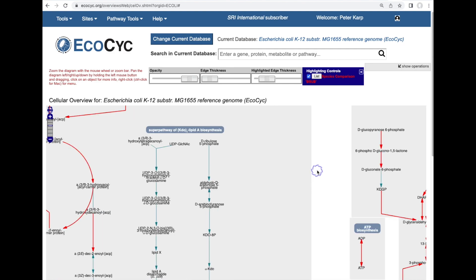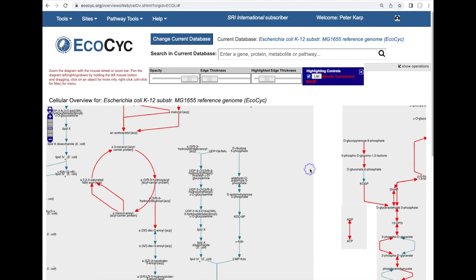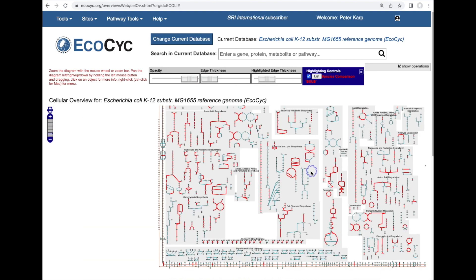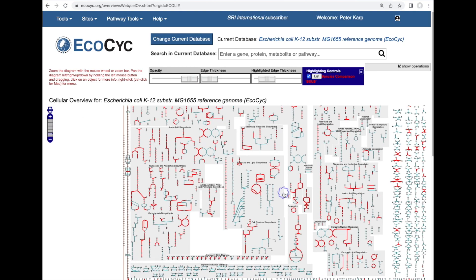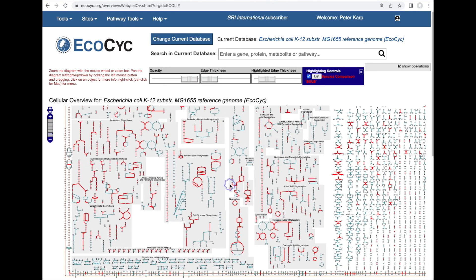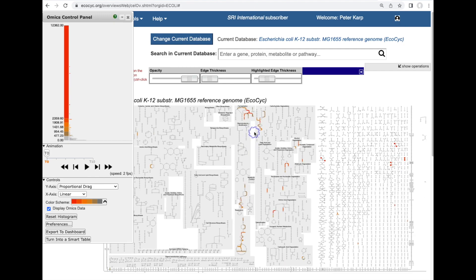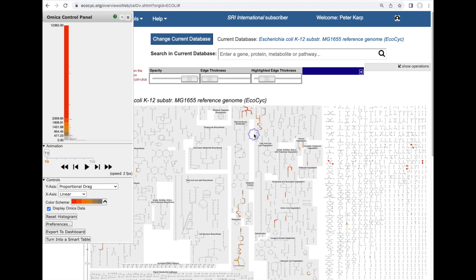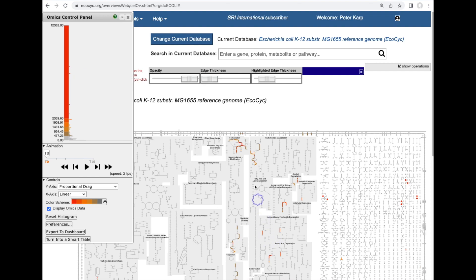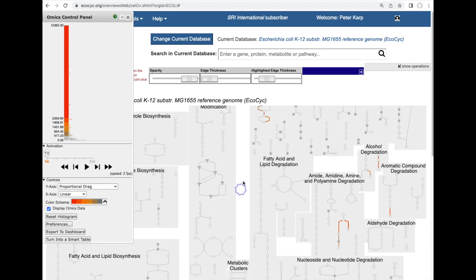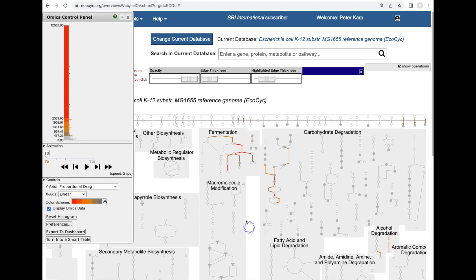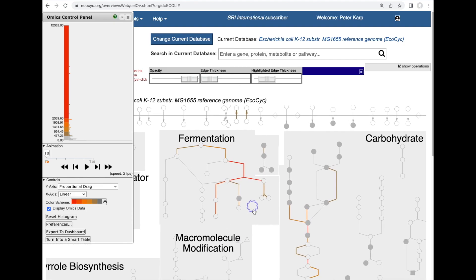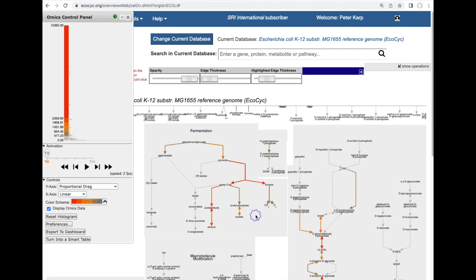Now we can also use this cellular overview diagram for analysis of high throughput data sets. Here I've read in a tab-delimited file of transcriptomics data for E. coli and the resulting transcriptomics data values are mapped to a color scale shown on the left and painted used to color the different reaction steps in the diagram and I can zoom in to see what's going on in more detail. We can see in this case the fermentation pathway is highly expressed.